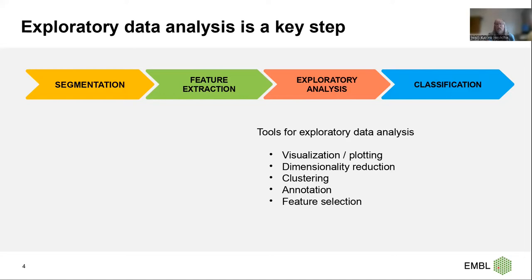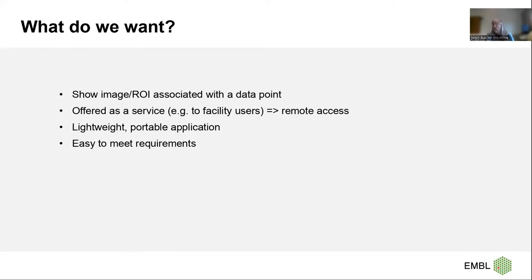So we want a piece of software that shows the image from which a data point is derived, with which data can be annotated, and which provides some helper data analysis functions. These features are already available in various pieces of software, most prominently CellProfiler Analyst or combinations of Fiji plugins.